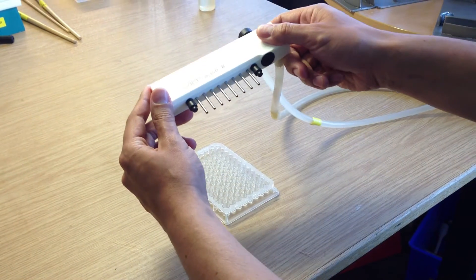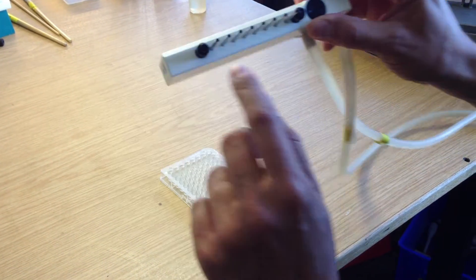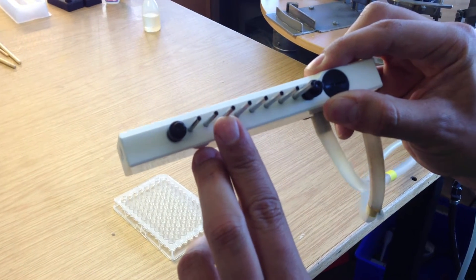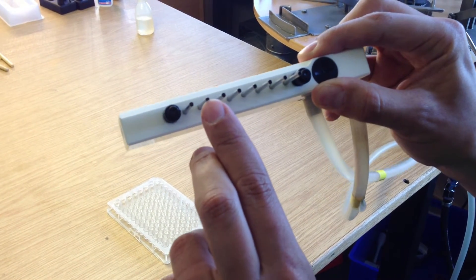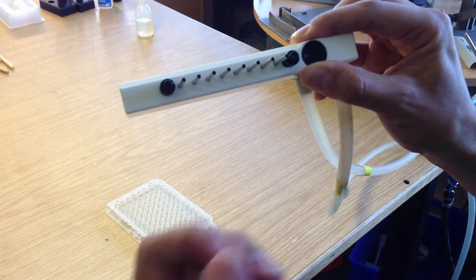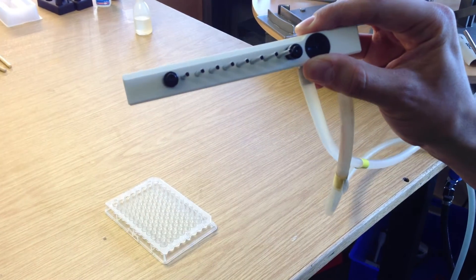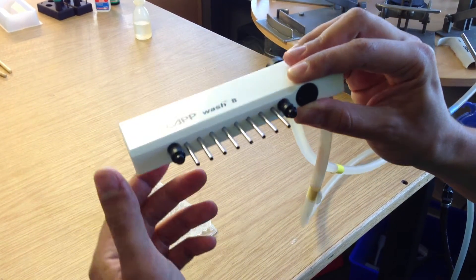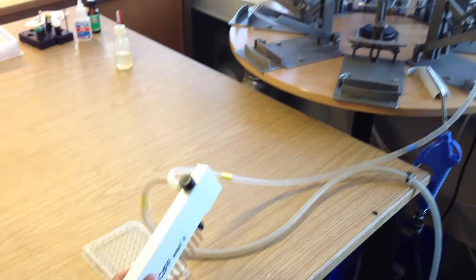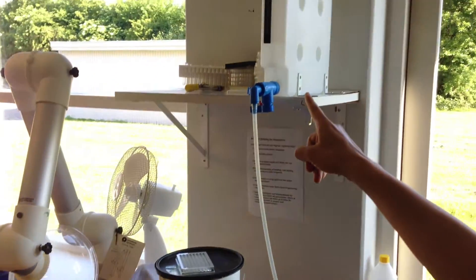Here we have the manifold, and the manifold has a two-in-one needle system where the inner tubing is responsible for dispensing the liquid and the outer tubing is responsible for aspirating the liquid after the washing procedure. Up here we have the bottle for the washing solution.